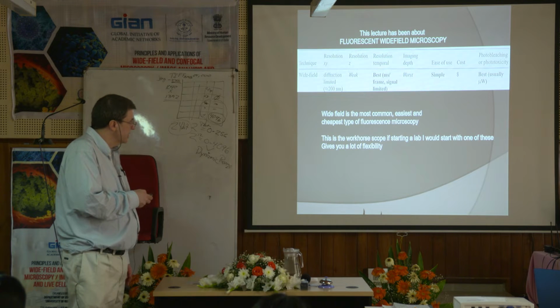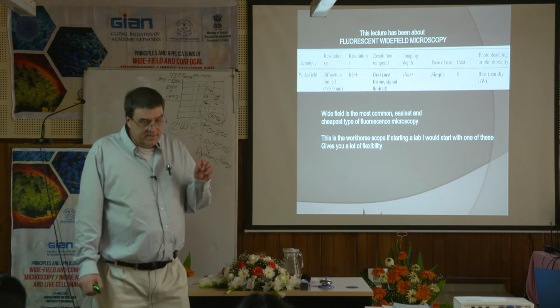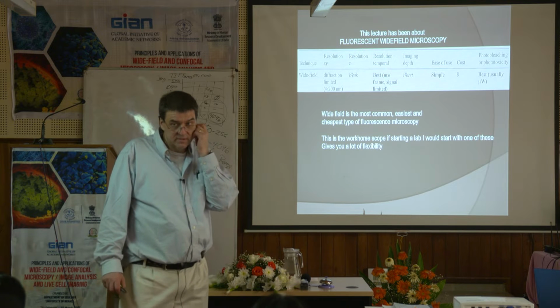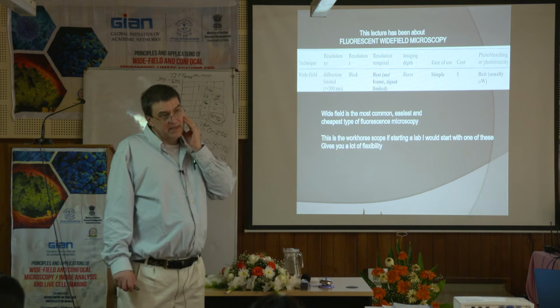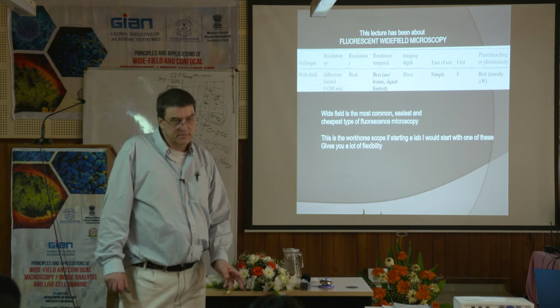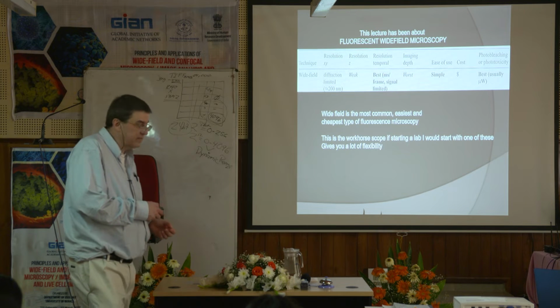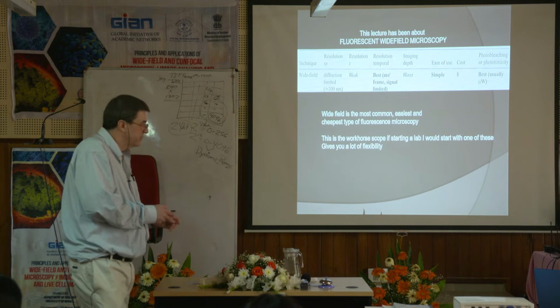And the other thing is for live cell. Now, we haven't gotten into live cell yet, but we will. This type of light is not as toxic as lasers in general. So this is a good way to do live cell imaging with a scope like this because it doesn't have the power of the lasers. And you have quite a bit of control over something like this. So it is a good live cell setup. This is what I do all my live cell stuff on. Once in a while we have to go to confocal for something special, but for the most part I'll do it on my wide field scope.